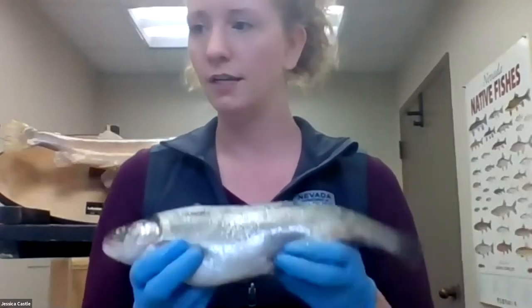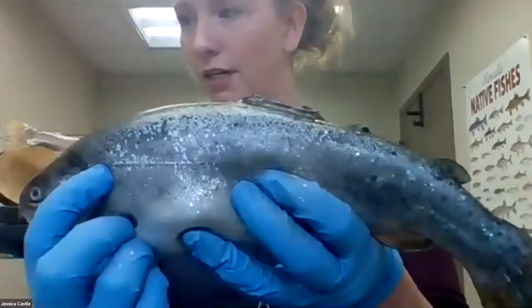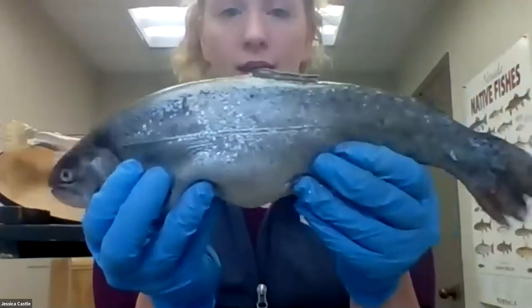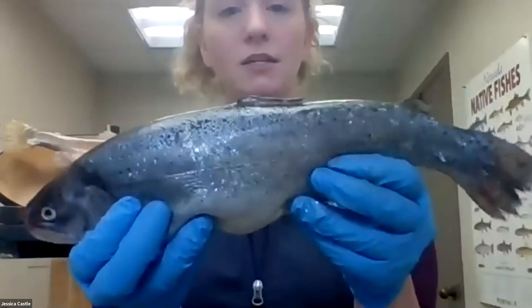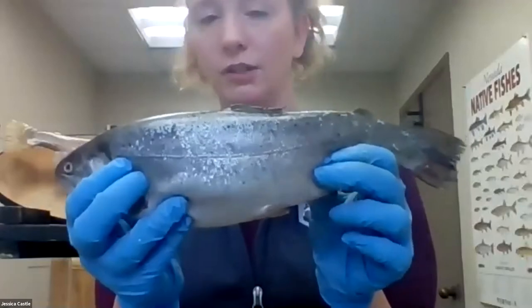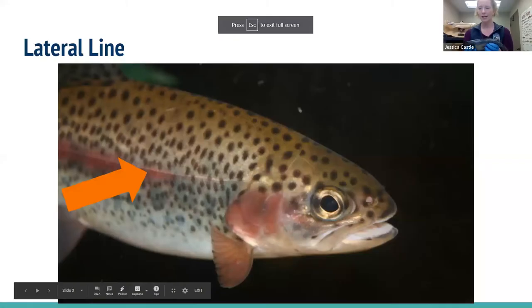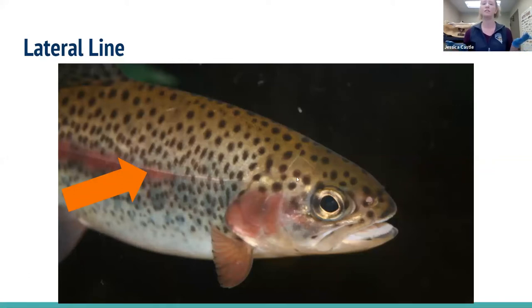The next thing we are going to look at is called the lateral line. You can actually see it running down the side of the trout, all the way down the side of the body. The lateral line is like a sensory organ for the fish. Humans have our senses — seeing, hearing, touch — and fish have this additional one. The lateral line helps them understand movements and pressure in the water, allowing them to know if there is a predator or even prey in the area by sensing those additional movements.